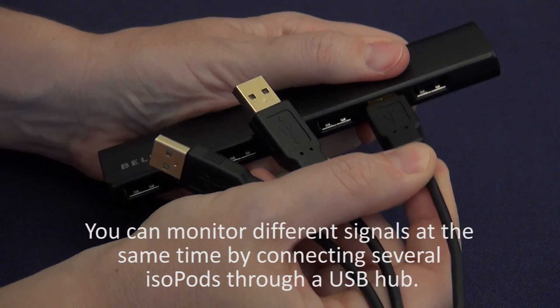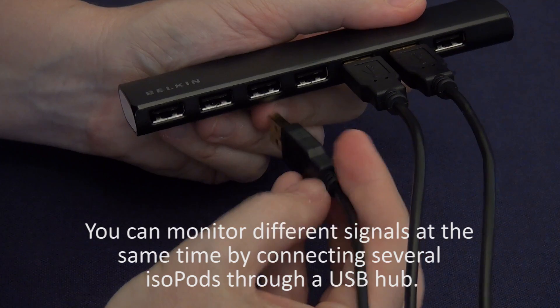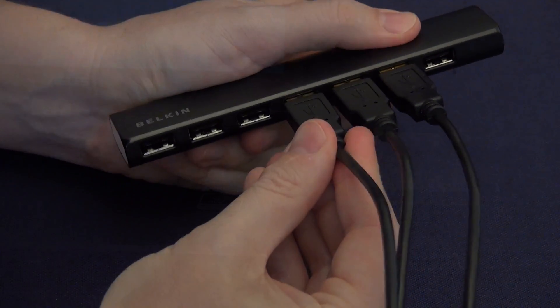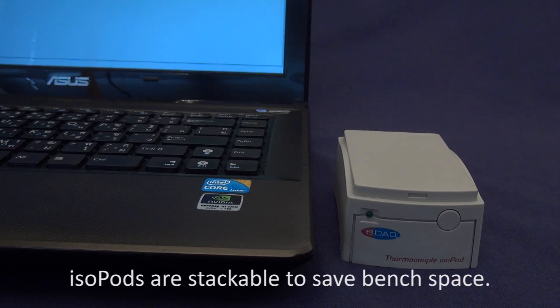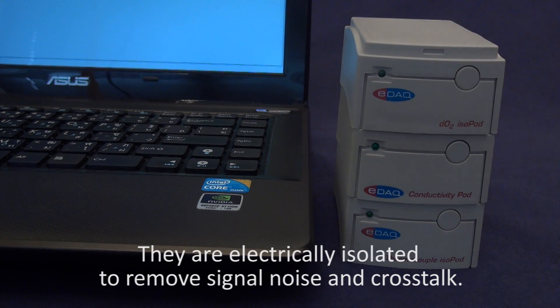You can monitor different signals at the same time by connecting several isopods through a USB hub. Isopods are stackable to save bench space, and they are electrically isolated to remove signal noise and crosstalk.